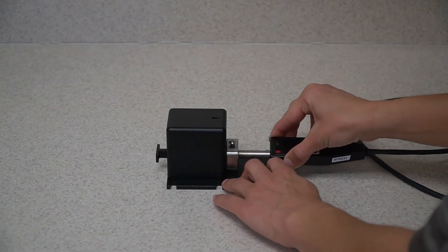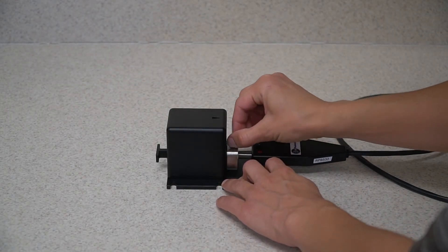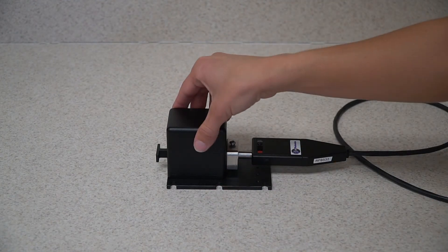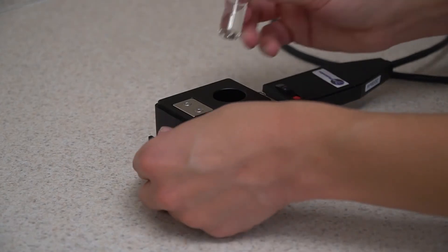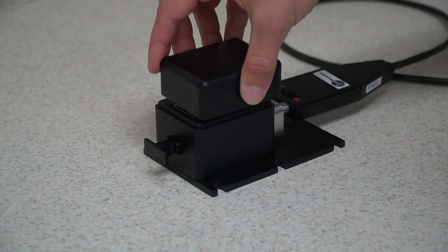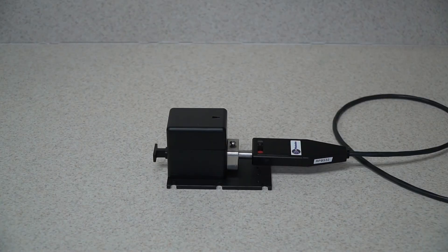Insert the Raman probe into the front of the holder. Turn or hand tighten the screw on top to hold the probe in place. Remove the magnetic cap. Pull back the sling and insert the vial, then replace the magnetic cap. Your holder is now ready for the Raman measurement.